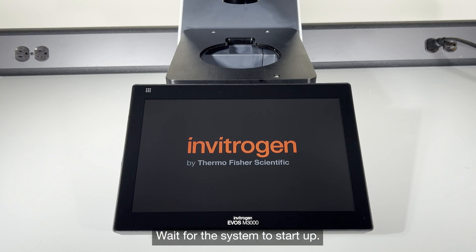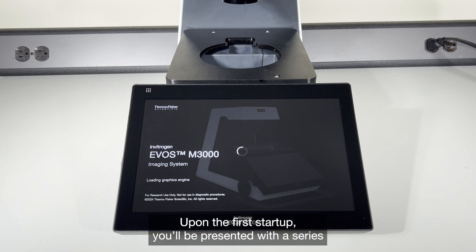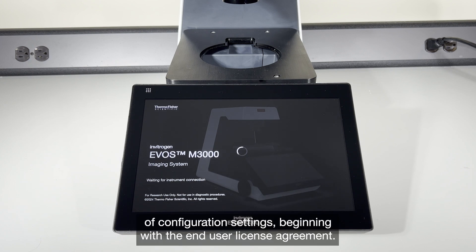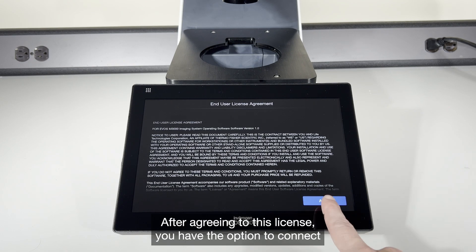Wait for the system to start up. Upon the first startup, it will be presented with a series of configuration settings, beginning with the end user license agreement. After agreeing to this license, you will have the option to connect the system to a local network using the USB Wi-Fi dongle.